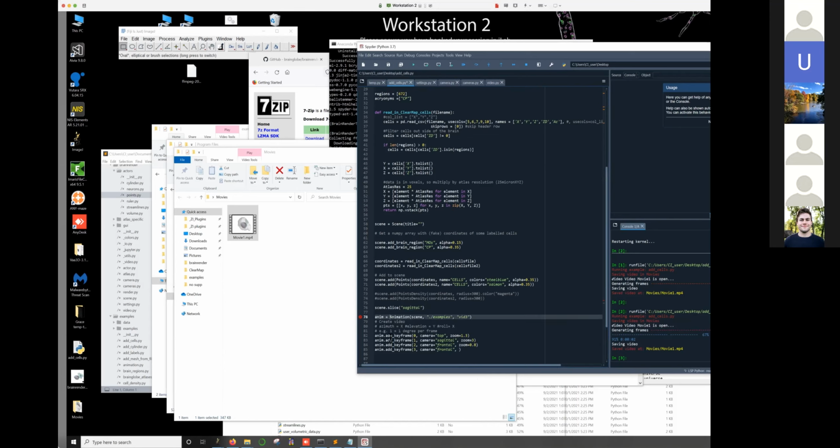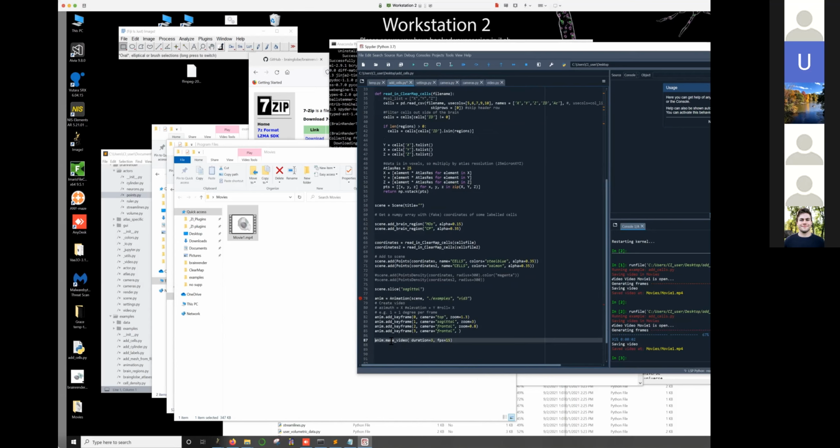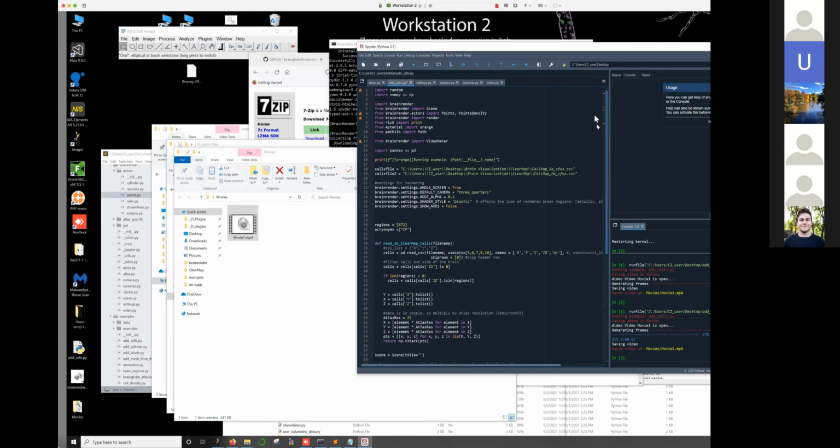Now what we're doing is saying, instead of just doing the rotation, I actually want to do some different views and different zooms. So here we've set some different views, and then we're saying how long the video should be. Actually, I'm just going to change this. And if we run this now, okay, we need to have the animation, so I'm just going to go back up the top here and change this to animation.